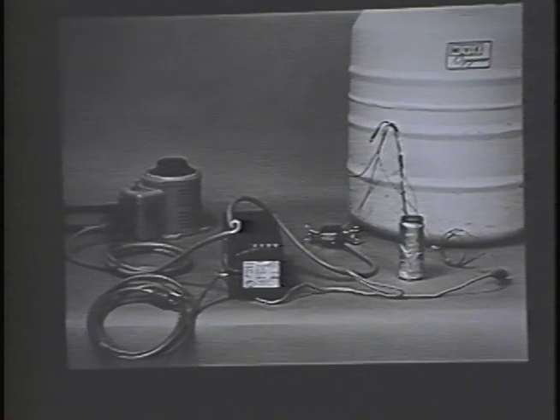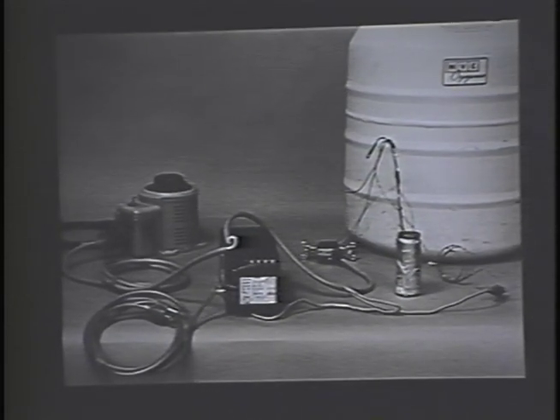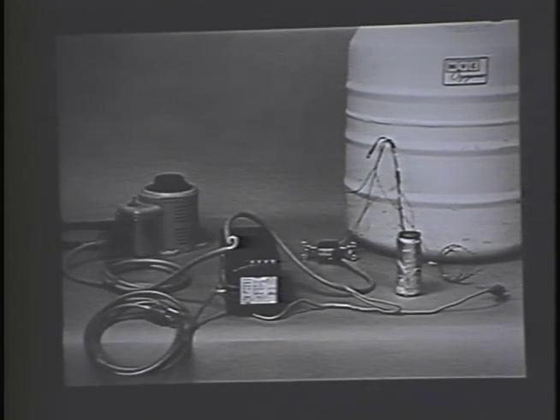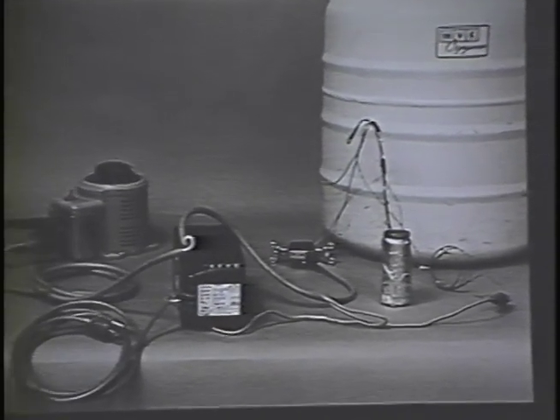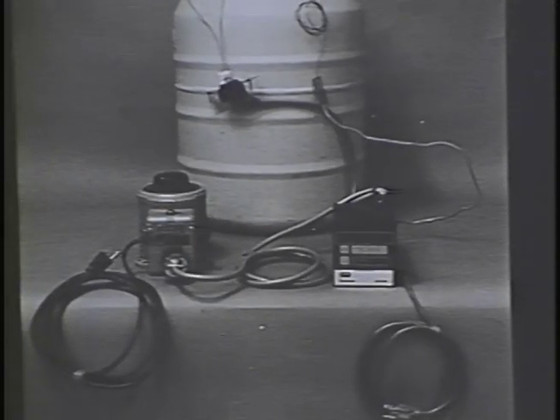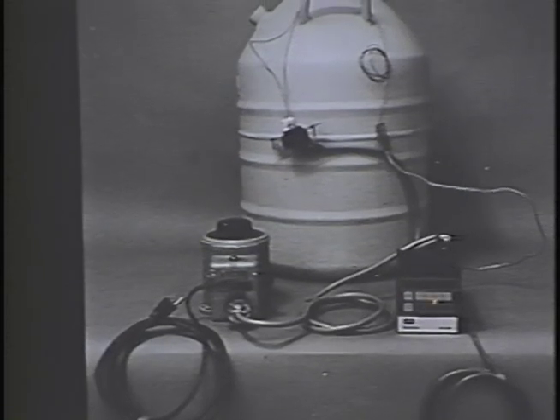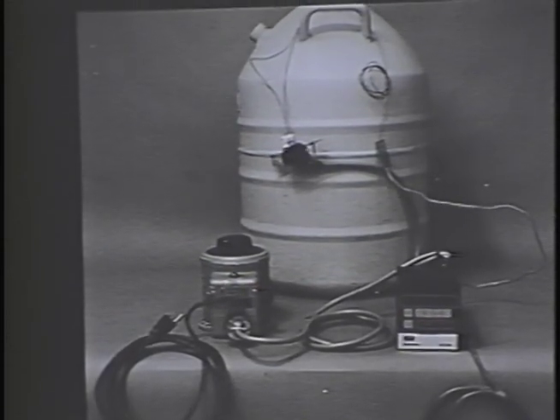This slide illustrates the freeze substitution apparatus we use, which can be assembled in the lab with a modest investment. It consists of a dewar filled with liquid nitrogen to cool a specimen chamber containing the frozen samples. Next slide. The specimen chamber is held at minus 90 degrees using an adjustable temperature controller and rheostat.